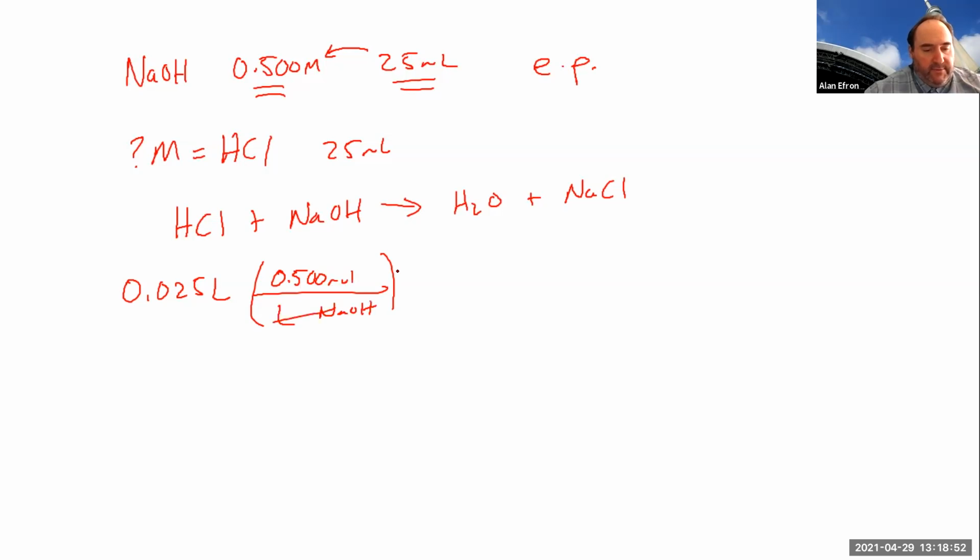Those liters would cancel. That would get you 0.5 times 0.025, which is 0.0125 moles of sodium hydroxide.